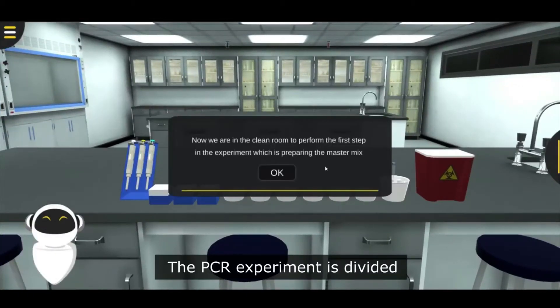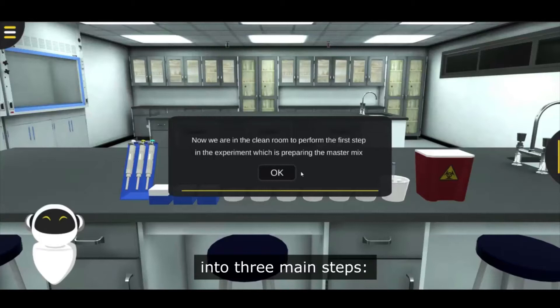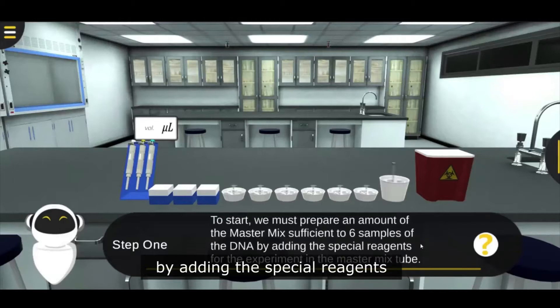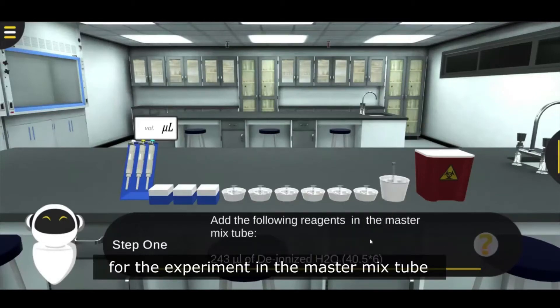The PCR experiment is divided into 3 main steps. First step: prepare an amount of the master mix sufficient for 6 samples of the DNA by adding the special reagents for the experiment in the master mix tube.